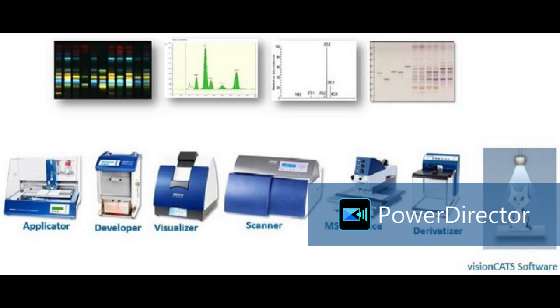Methanol is highly evaporative, na? Because we are preparing our samples in methanol itself. We are applying on the plate, and after application, methanol evaporates out from the plate. So detection is critical on HPTLC.